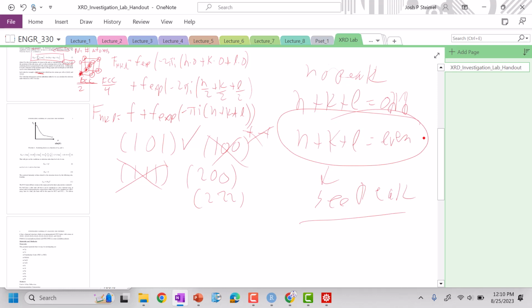So this is fantastic because when we compare our experimental XRD plot to a printout from the International Crystallographic Structure Database, which is very expensive software that allows you to compare your data to the database, where they compile all of their crystallographic structure data. So it's a very, very useful tool. So this is fantastic. We're going to be able to do this.